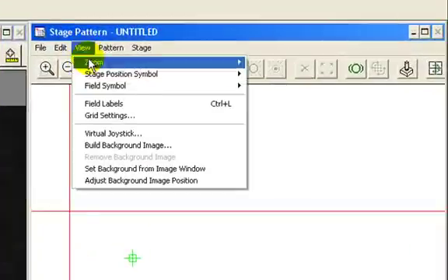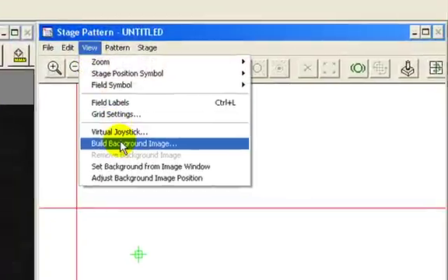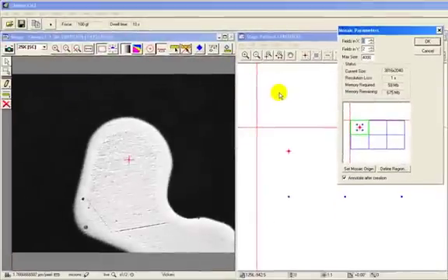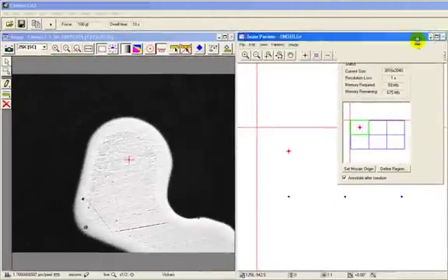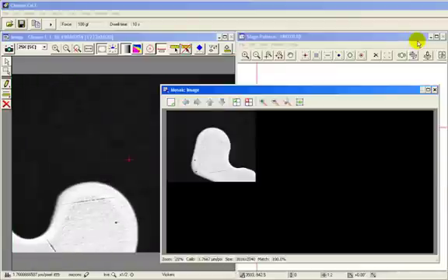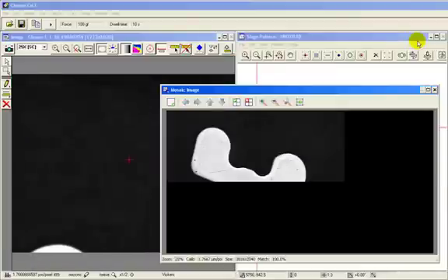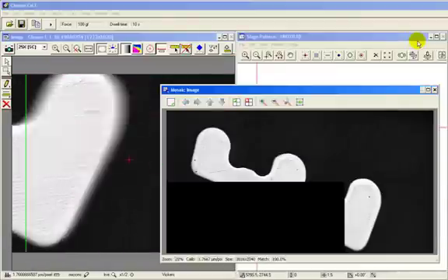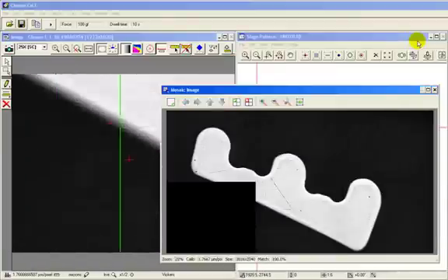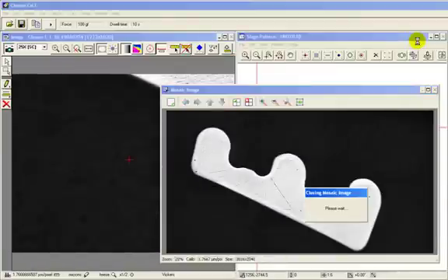The mosaic feature uses a motorized stage to scan the component at low magnification and stitches all images together to get a full view of the part to be tested.